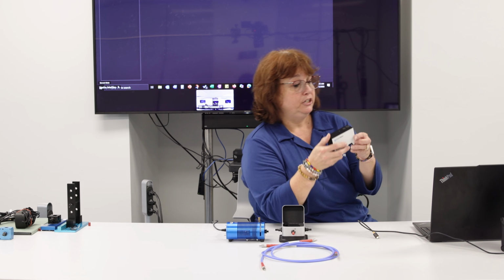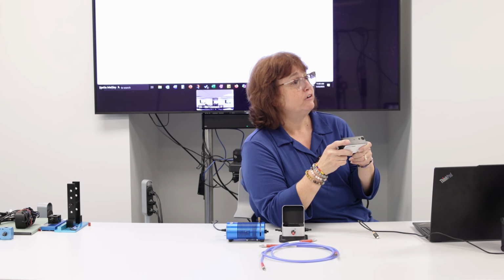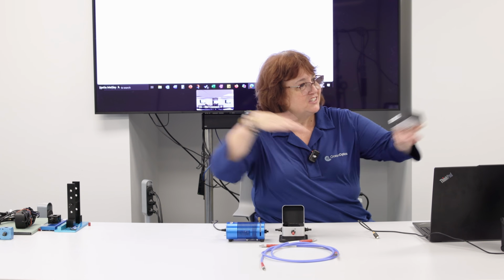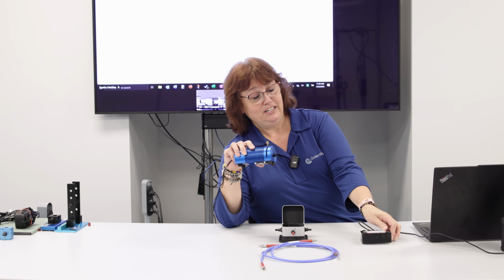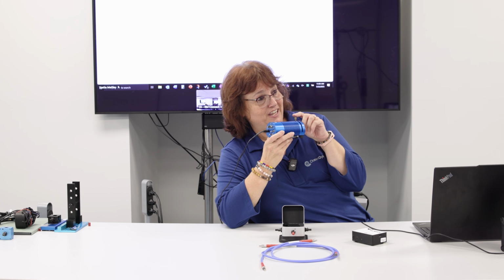So in this case, I'm going to use the SR4. All of my spectrometers that I have here are XR versions, so they cover 200 to almost 1,000 nanometers. They're nice general purpose because they cover that wide wavelength range. We're actually just going to be looking in the visible with our light source, which will be the HL2000 HP-FHSA.